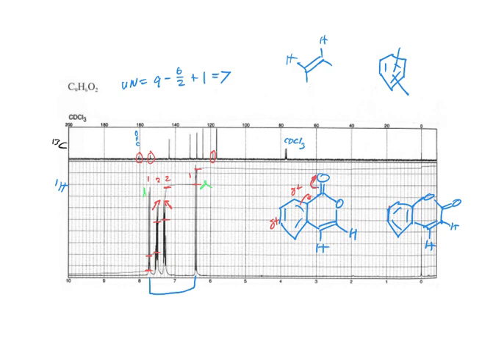Would that push the alkene carbon downfield, not upfield? Well, I think what it would do is that we have one carbon that's down here, right, at over 150. And that has to be the carbon that the oxygen is attached to. So that either has to be this carbon here or this carbon over here, right? So it's either in the benzene ring or not.